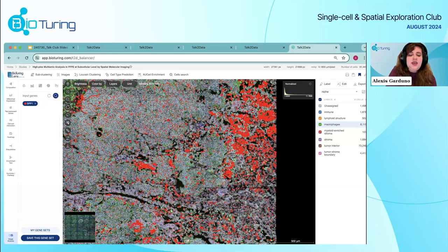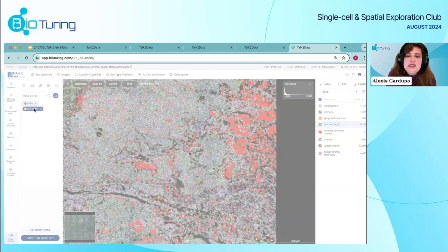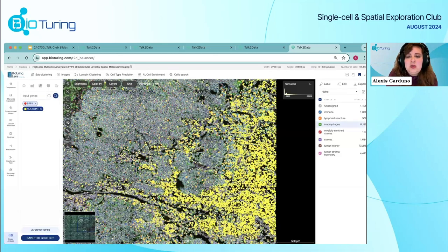If we want to see whether there's any role relating to this type of marker, we can query it as well and see if the expression is also located there. Again, we see these macrophages mainly expressing this HLA-DQA1 target, and the transcript information is mainly enriched within all of these macrophages in this tumor site region.